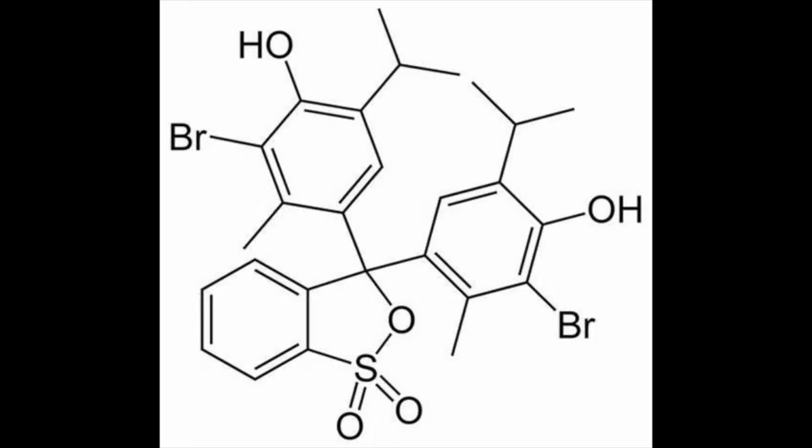6.0 and 7.6. As seen by the name, the substance itself is blue, but in a neutral solution it will turn green. In an acidic solution it will turn yellow, and in a basic solution it will be blue.